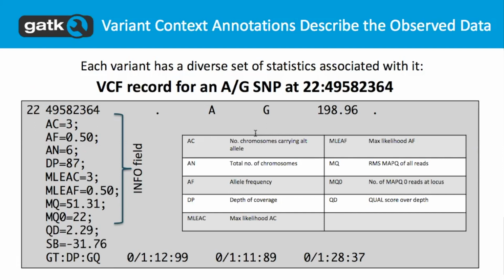So is this the VCF file? Yes. The final VCF that is output, the one VCF file after joint calling. Yeah, after the genotype refinement stage.